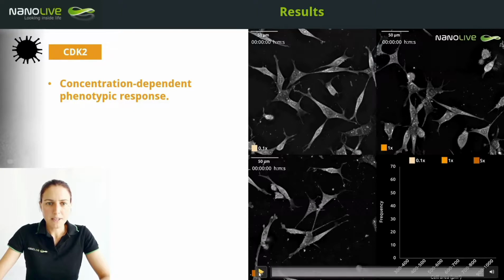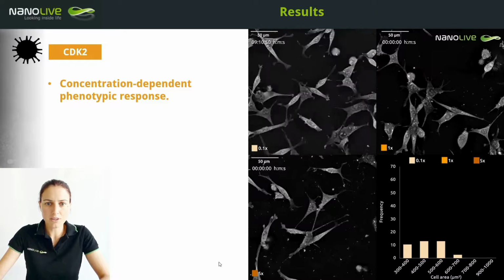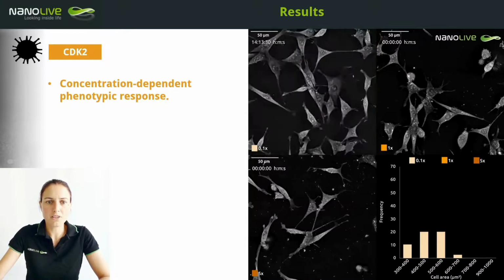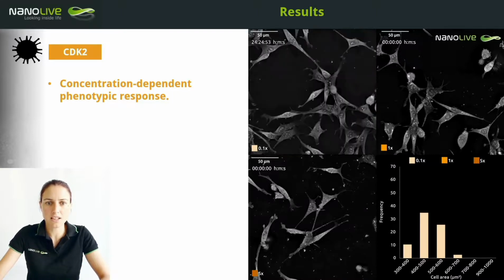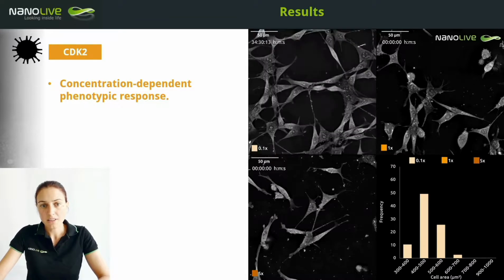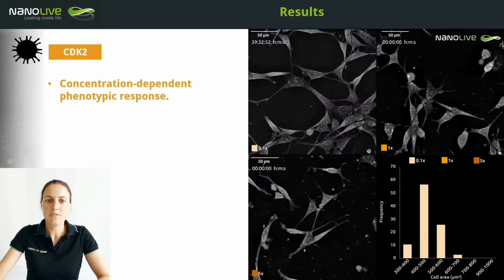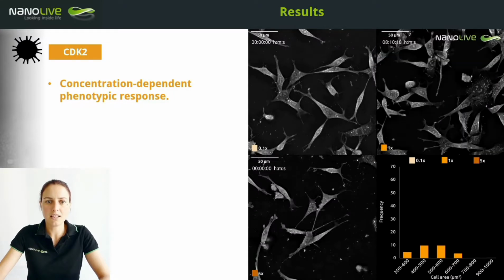So I'm going to start to play the response of the video from the CDK2 inhibition. And the first time I show you these videos, you may well think that the cells resemble that in the negative control. It's true that the morphological response of CDK2 is much less pronounced than the drastic nuclear changes we observed in the pre-adipocyte cells. However, cell metric analysis revealed there are subtle concentration-dependent shifts in cell size.